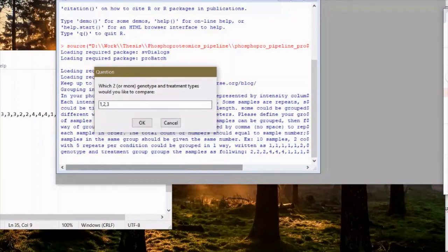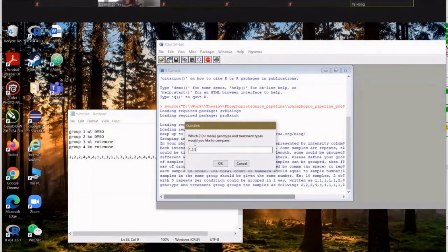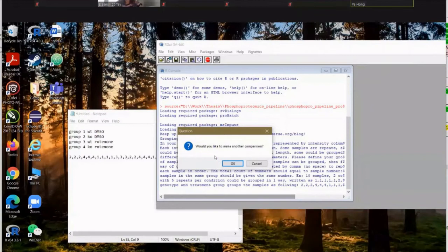It will figure out on its own. And so if you plan to compare more than 2 groups in your comparison, it's good, in the beginning, to choose normalize and impute for your imputation options. We'll show this like 3 comparison as well, I guess, here. So I'll just choose 3. So I will have these comparisons, and now I will click on cancel. So they will just make these comparisons and no more.